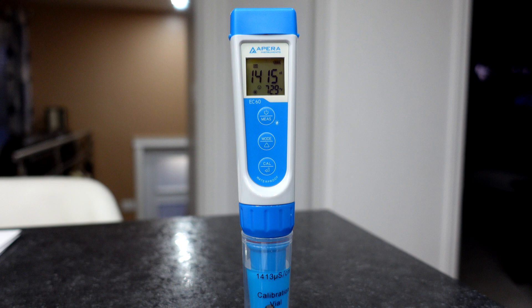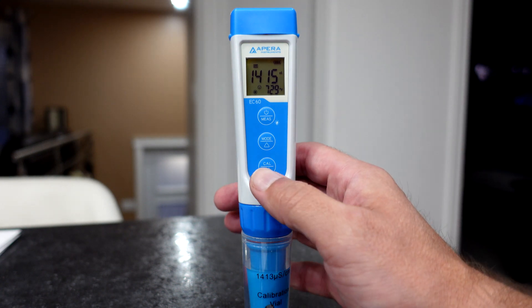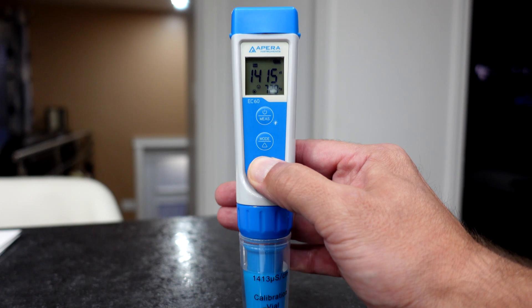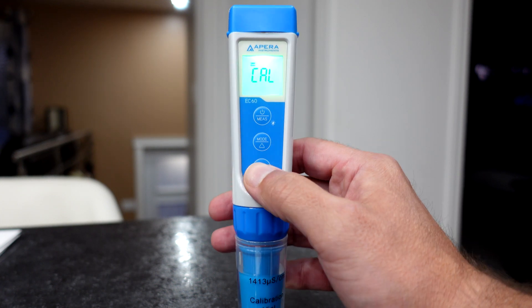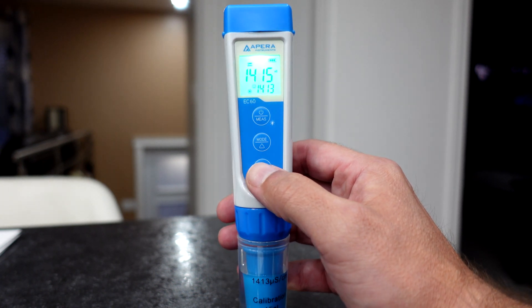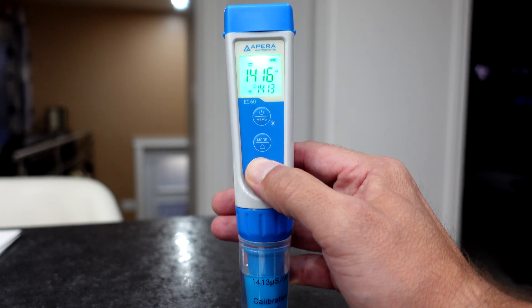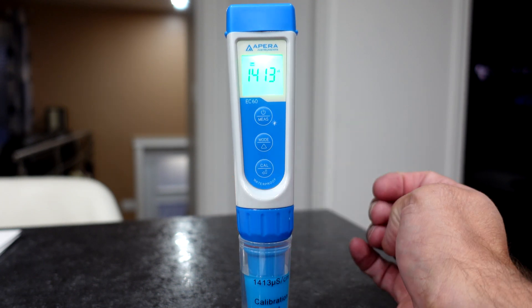According to the calibration, we need to do this a second time. So we're going to push and hold that again. And we've got a smiley face — push. And there's our calibration.